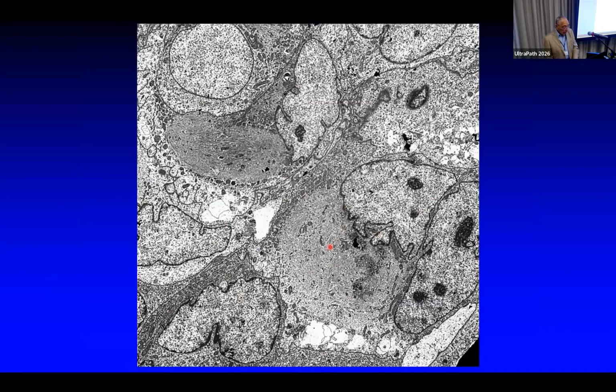And here are some illustrations. The structure of the epithelioid sarcoma has intermediate filaments forming a paranuclear ball with a replacement or pushing of the nucleus.